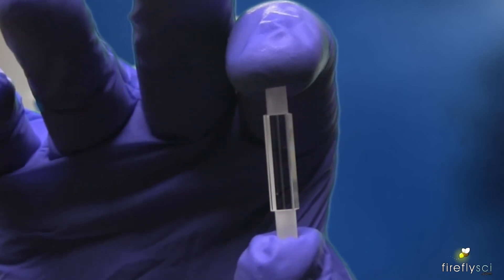which is called a flow cell or a flow cytometry cell. In this video we're going to take a look at flow cells, how they're made and what they're used for. Let's get started.